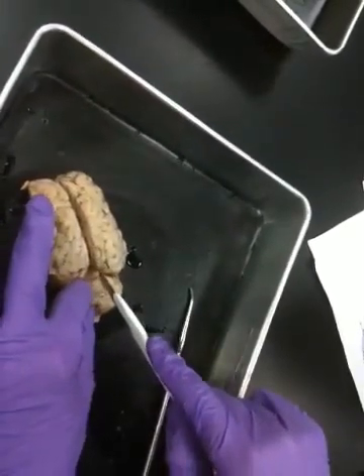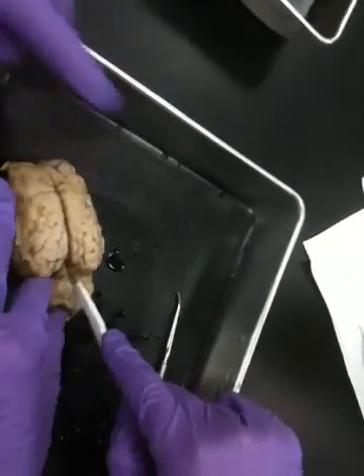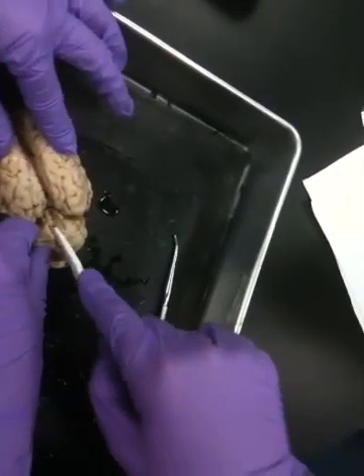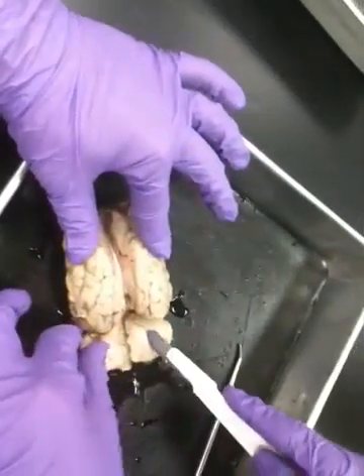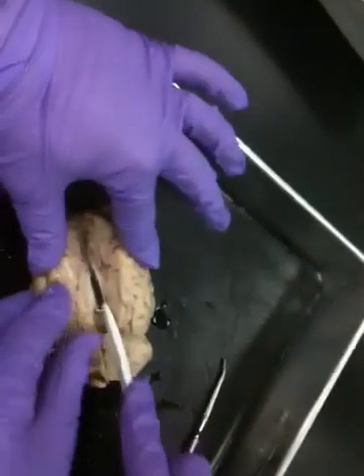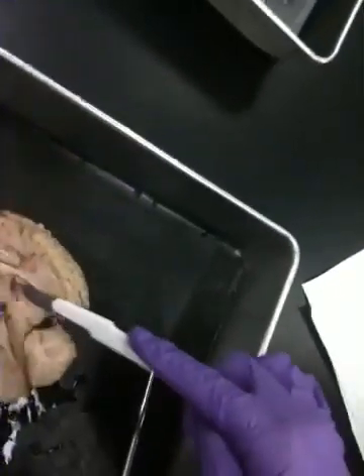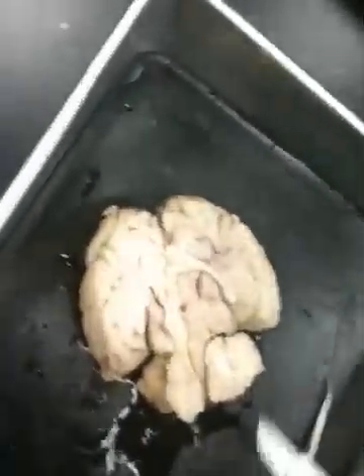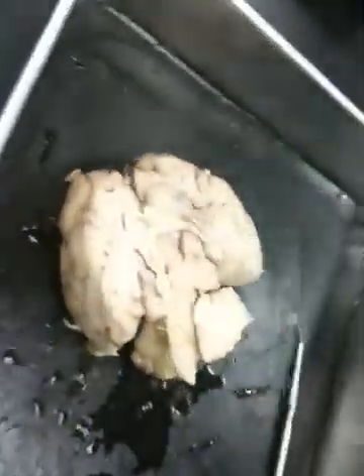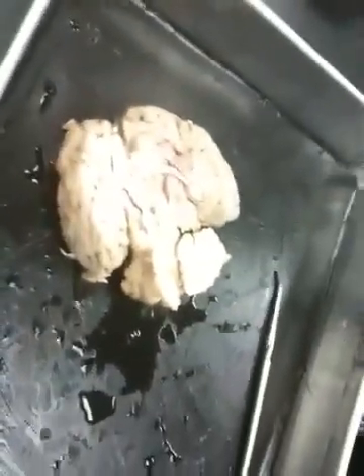It's much nicer than the eye that we're about to do. Sorry. That sounds wonderful, doesn't it? And you said cut this part too? Yeah, the cerebellum, all the way through. That's not really the center, please do. About eating sweetbread. All the way through the cerebellum. Keep going. Ooh. Very scrambled eggs. Yeah. Like overdone. Oh, man. Overdone. I'll never eat them again. Okay, great. Good. Oh, good job. Okay, it's perfect.